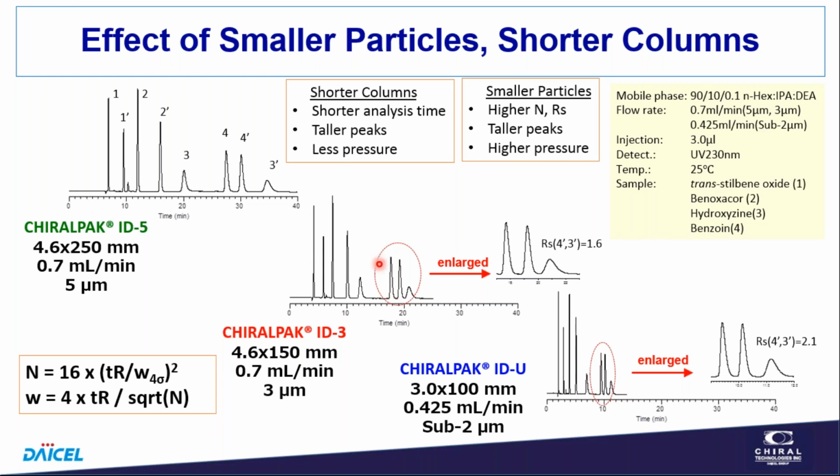But one of the other issues is you don't want to have just good enough separation in your method when you develop it. You want to have some leeway, so that if there is some variability from instrument to instrument, or some variability in a stationary phase or whatever, you have enough resolution to overcome some slight differences in the observed resolution with your method. So part of making a robust method is not to have just barely any separation. You want to have plenty of resolution.